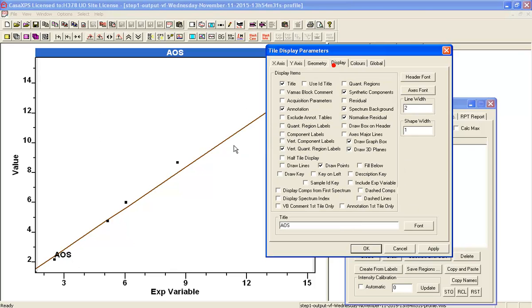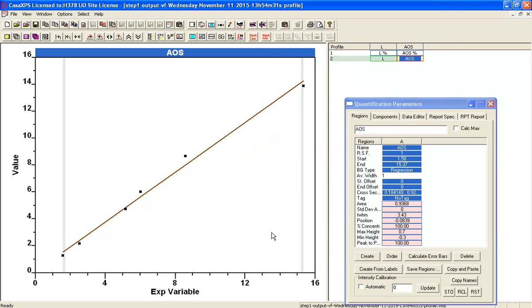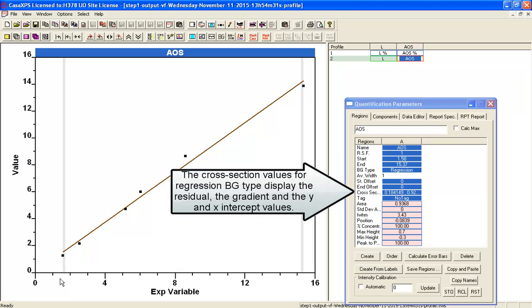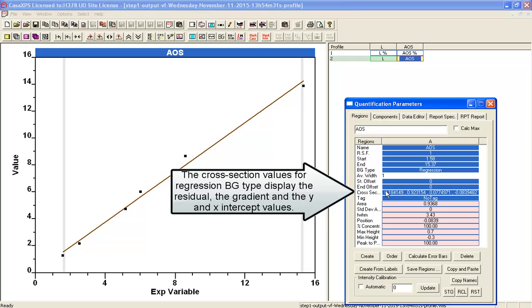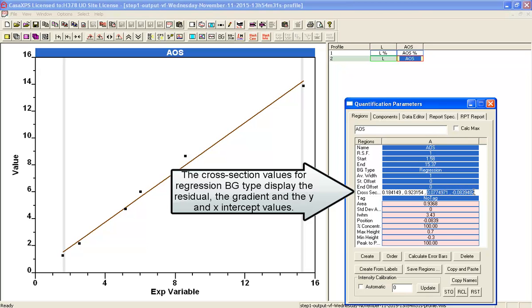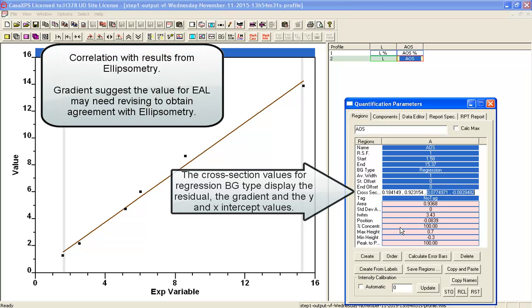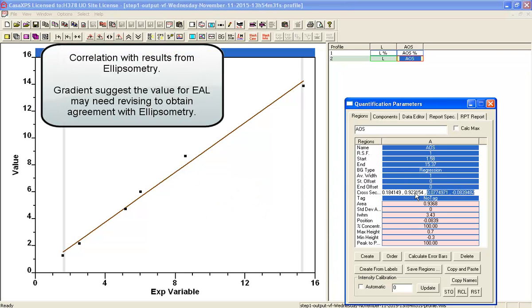And one further thing, I'll get rid of this label here by selecting that button. And now we can see that we've got an approximation in terms of a film thickness and how it relates to some values that were determined by ellipsometry. And there's a pretty good correlation here. And if I look at the values that have been entered into the cross-section field when I've got a regression line, I can see that the first term is the residual, and then that's the gradient, and then we have the intercepts here. So you can see it's pretty close to going through the origin here, so there's a good correlation. And we're probably underestimating the film thickness compared to ellipsometry by virtue of the fact the gradient is not exactly 1 in this case.